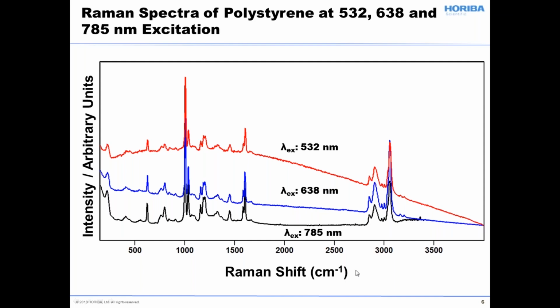And you see that they're plotted on a Raman shift scale with units that are the same as what you would observe in infrared absorption spectroscopy. Hence this complementarity, because you're probing the same kinds of transitions, I should say.